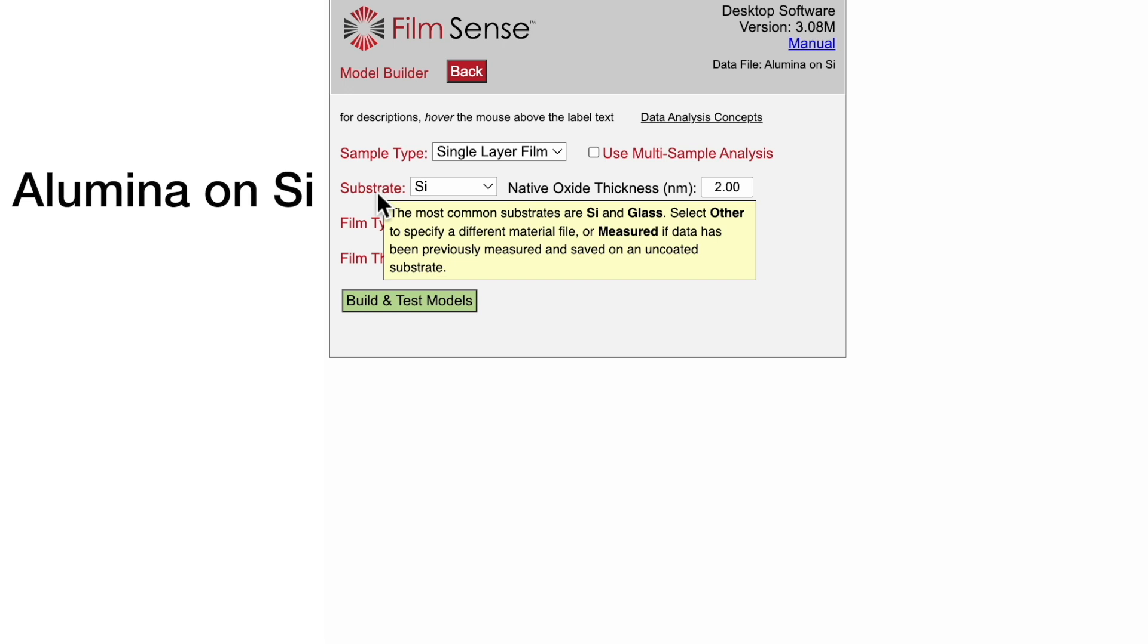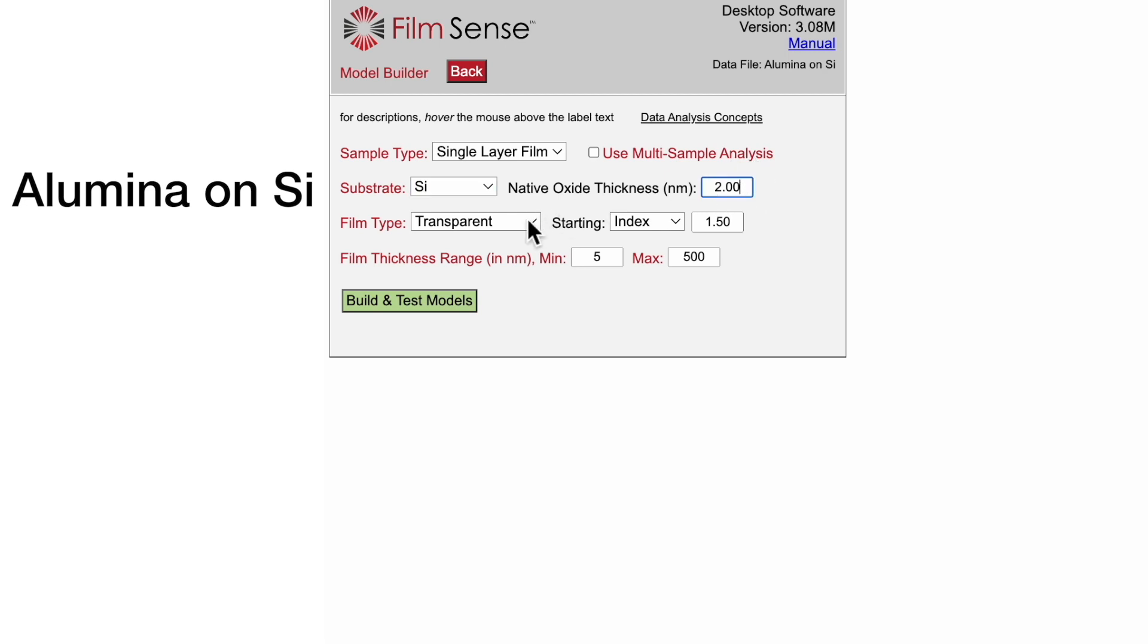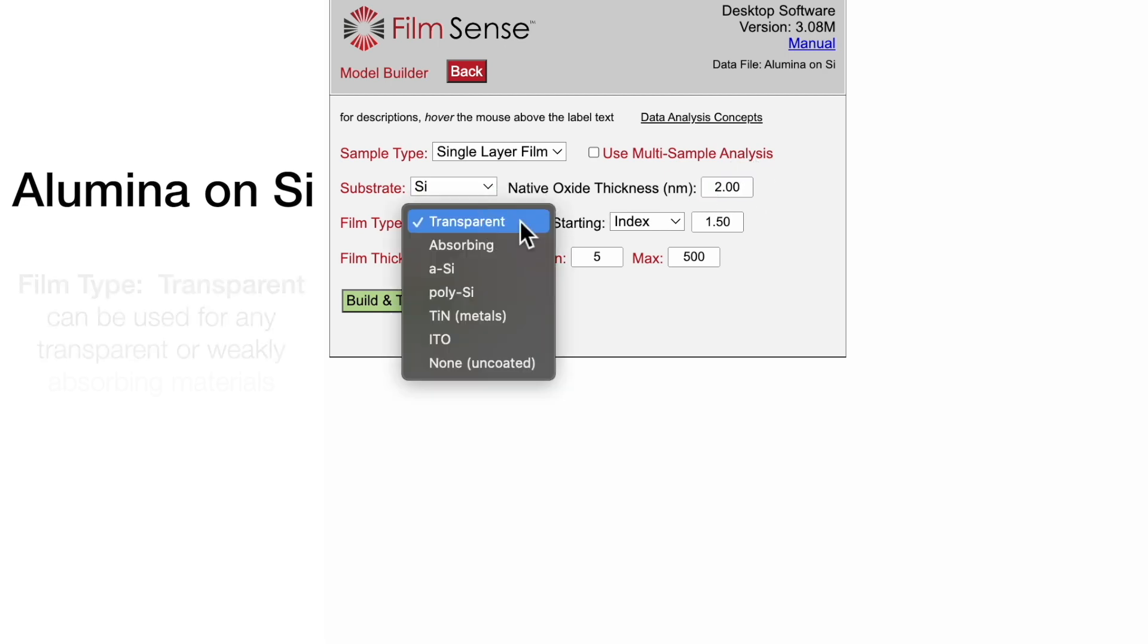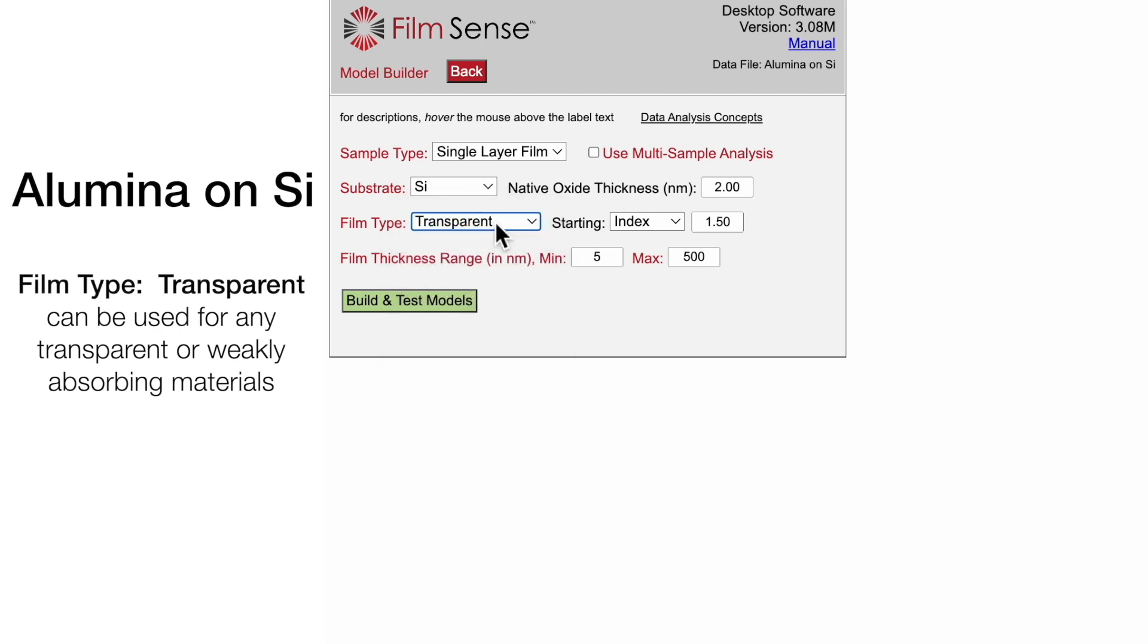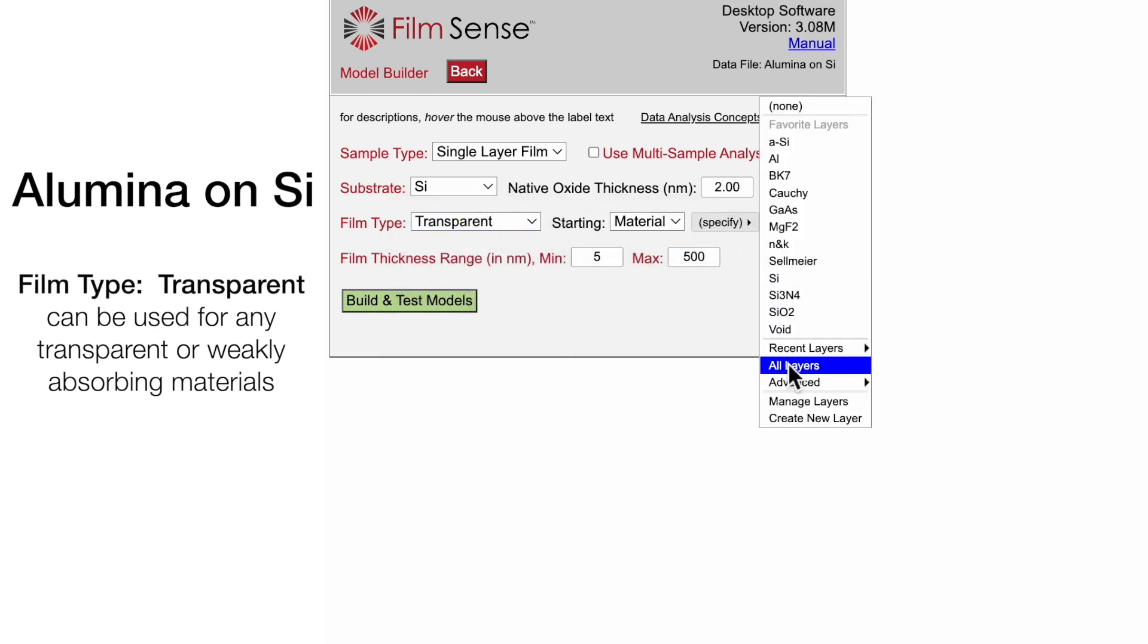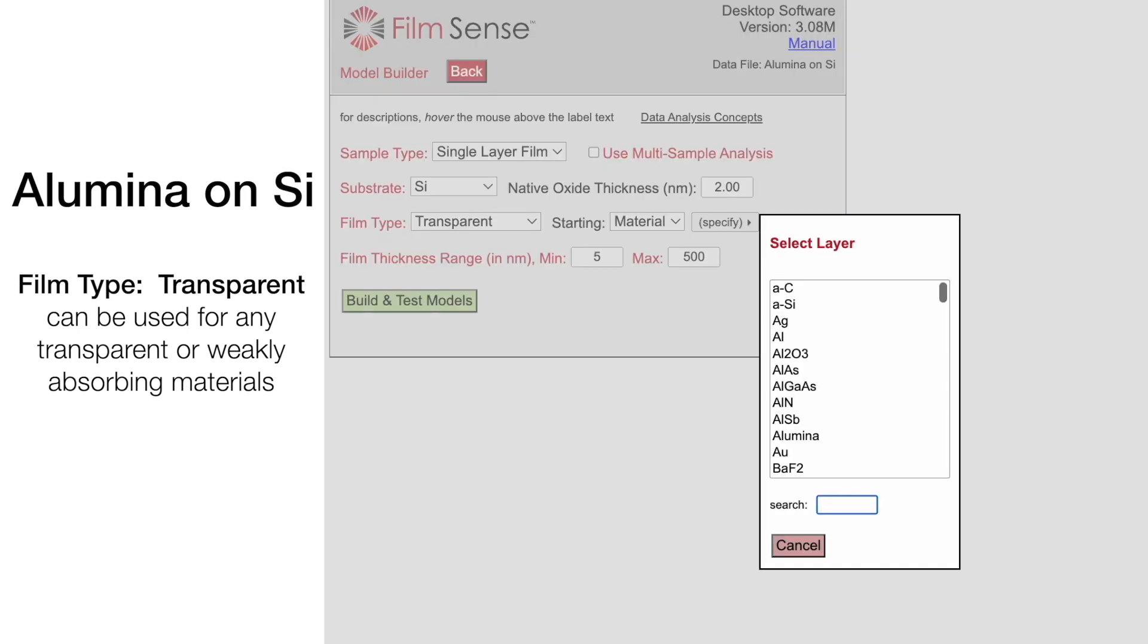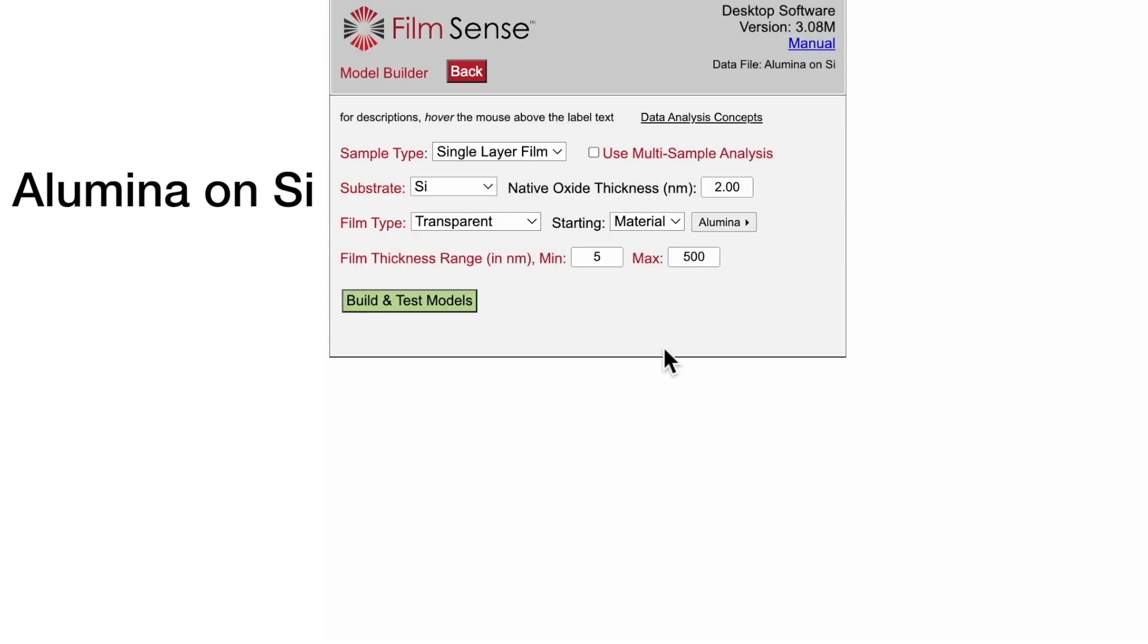First, select the substrate type as silicon, and we will use the default value of 2 nanometers for the native oxide. Next, select the film type as transparent and specify the starting material as alumina. And finally, we will use the default film thickness range of 5 to 500 nanometers.